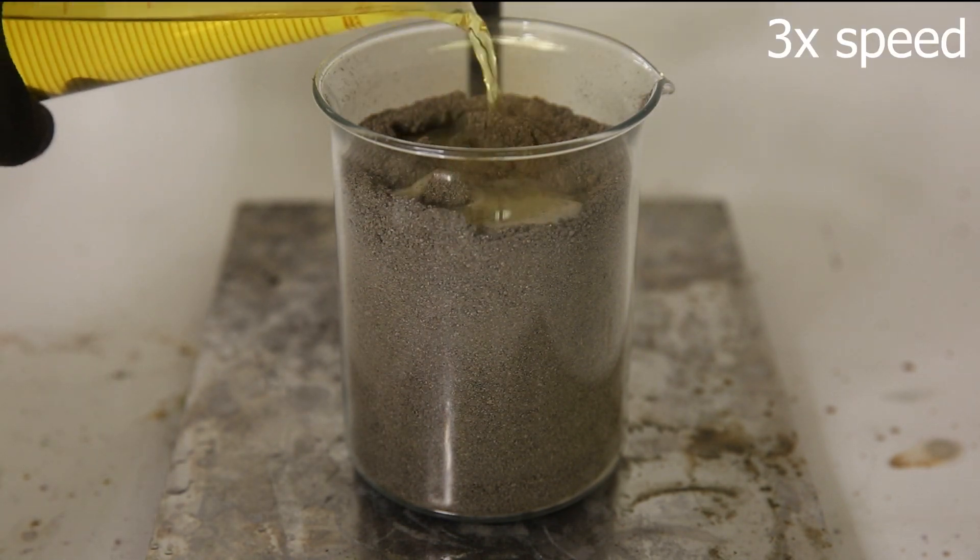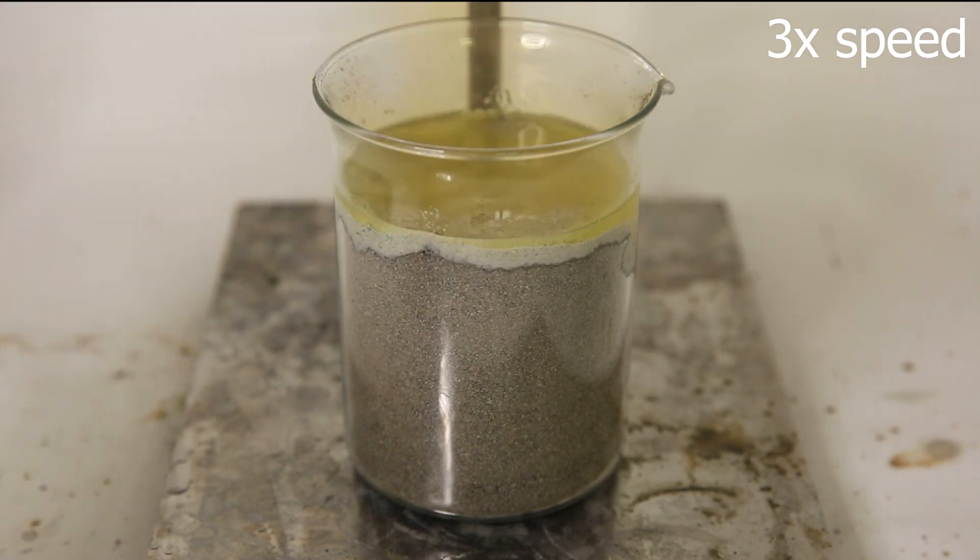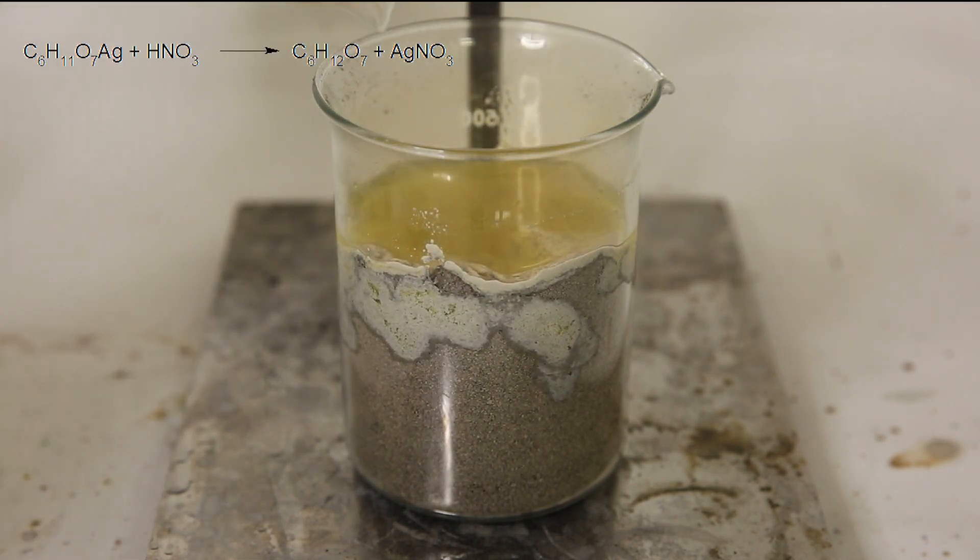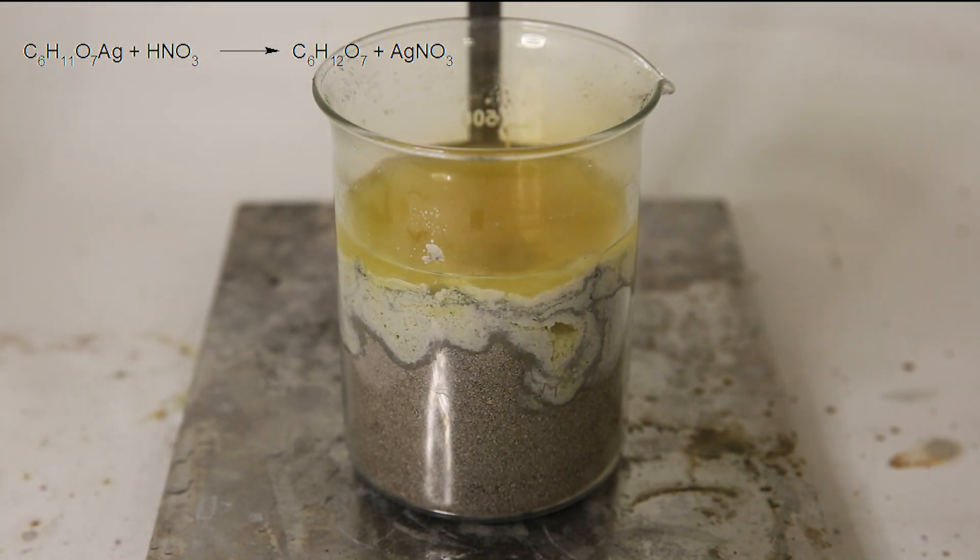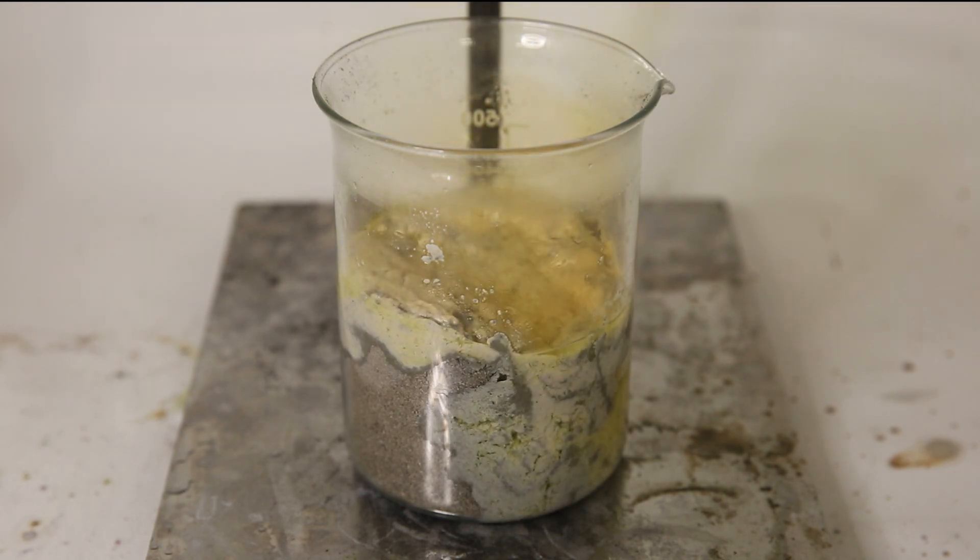So to the powder, I add about 100 milliliters of 90% nitric acid. We can instantly see the powder basically melt away and see the formation of the silver nitrate and gluconic acid. Part of it dissolves and the undissolved part we see as the white stuff.